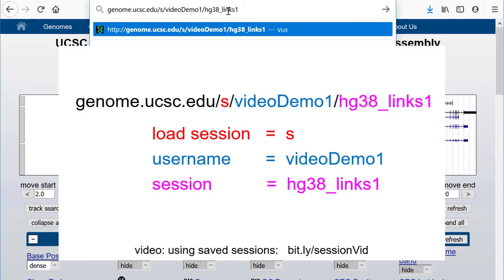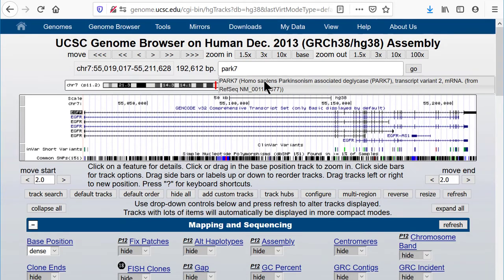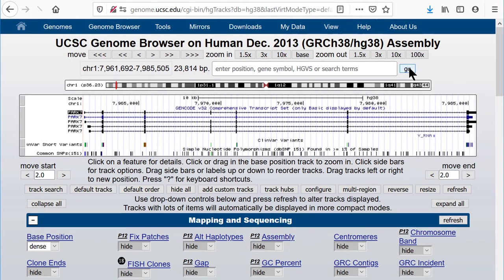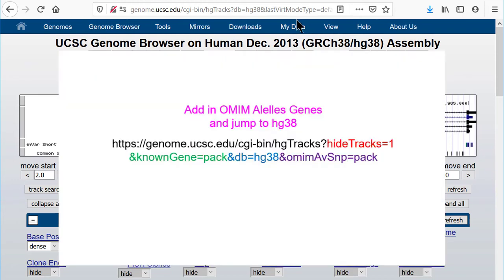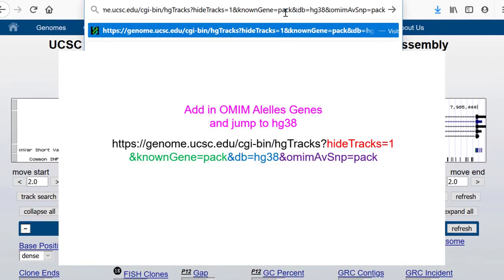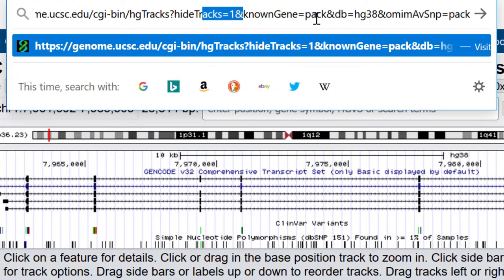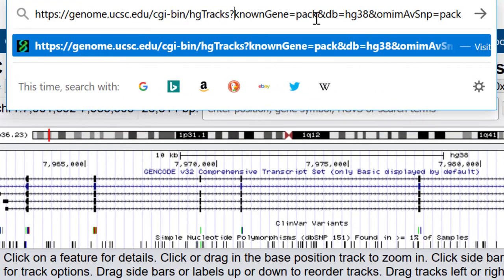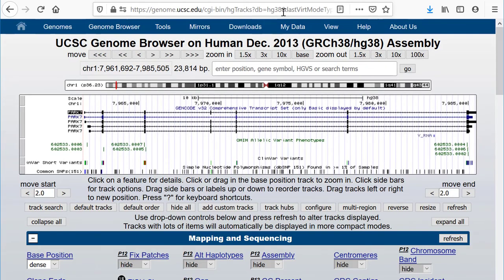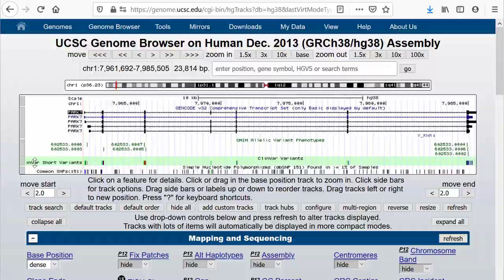Let's redo it without the hideTracks parameter. Load the session again and go to a different gene, PARK7. Now we'll load that earlier URL, removing the hideTracks parameter. The result is to add the OMIM Alleles track but without removing the existing SNPs and ClinVar tracks.